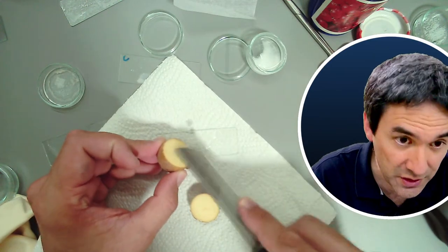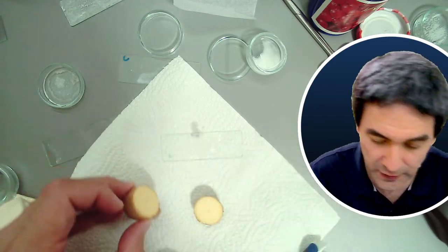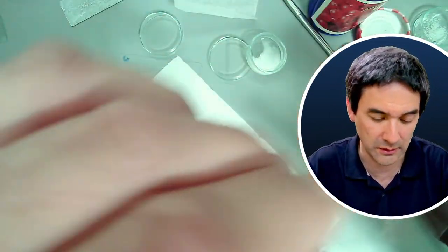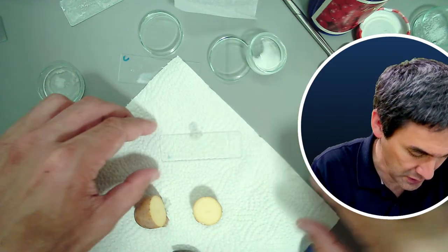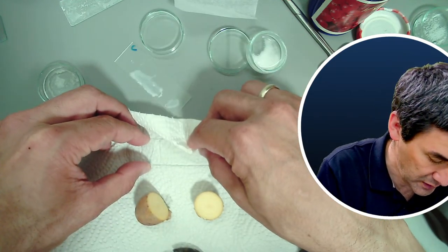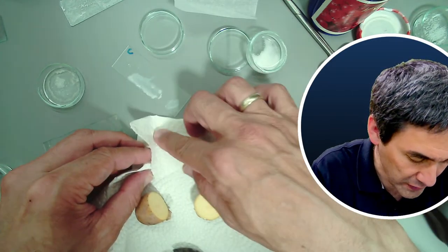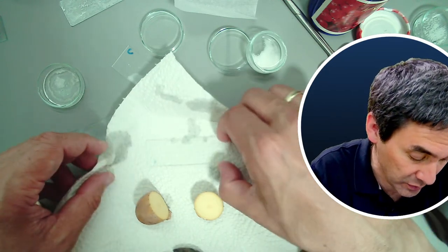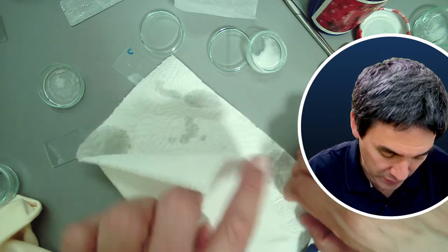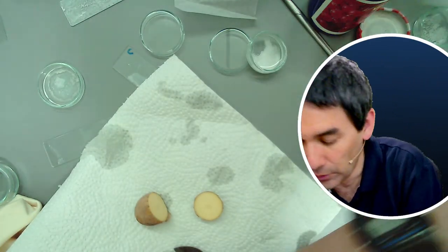And you already know how this works. Okay, and we're finished. Cover glass goes on top. I'm going to use a large cover glass today. It's a little dirty. Who cares? Any excess liquid will be removed. Starch grains are normally one of those standard things that you want to look at with a polarization filter. I'm really doing this very sloppily, but it doesn't matter. Let me see. I think it should work out. So let's give it a try.